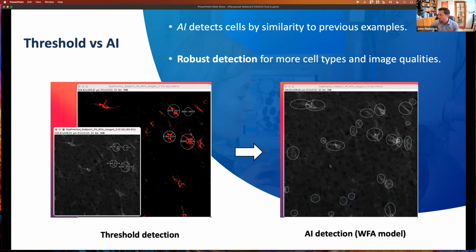Object detection does a really good job of putting ROIs around these objects, and it can look for the morphologies that are very specific for what you train it for. And that really helps us pull apart some of these difficult to distinguish cells like this guy here. In the case of these perineuronal nets, I think this is actually a gap junction between two neurons. And so this is not something that we would have been able to pick up through a segmentation approach.